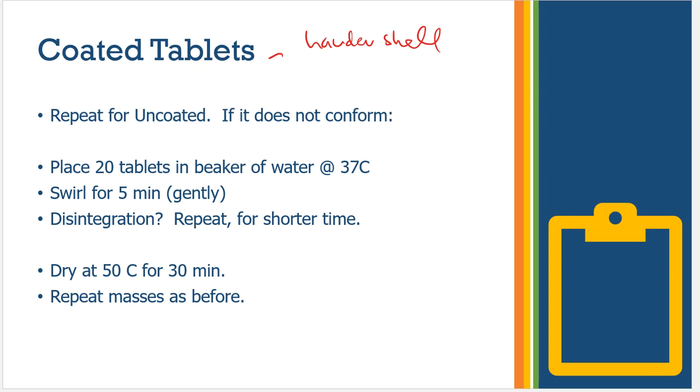And that harder shell, we've got to treat a little differently, because that shell is coated on the surface of the tablet once that tablet is pressed. So the tablet is pressed in that form, and then this harder coating surrounds it to help keep the tablet together so it doesn't break up. Or maybe they want an extended release time once you swallow it and get it inside your stomach.